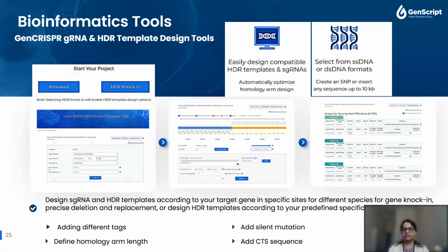They can optimize the sgRNA by adding a tag or purification option, or localizing the target protein, etc. Additionally, users can specify the quantity, purification method, and delivery format. So this is a very basic tool which is always needed, and it's available free online.